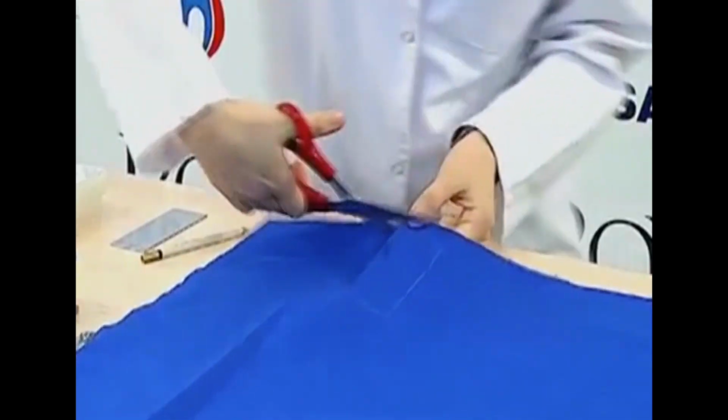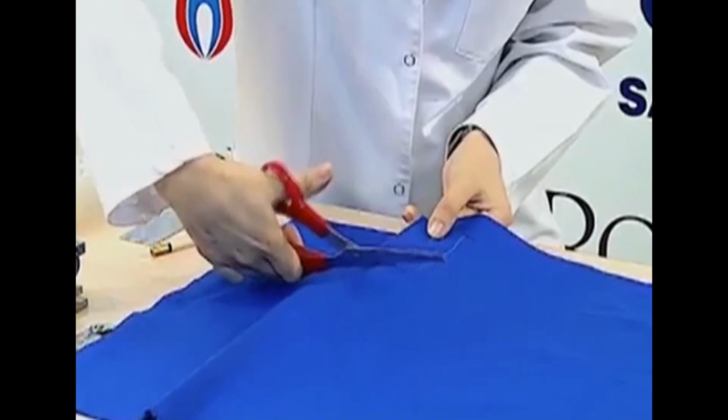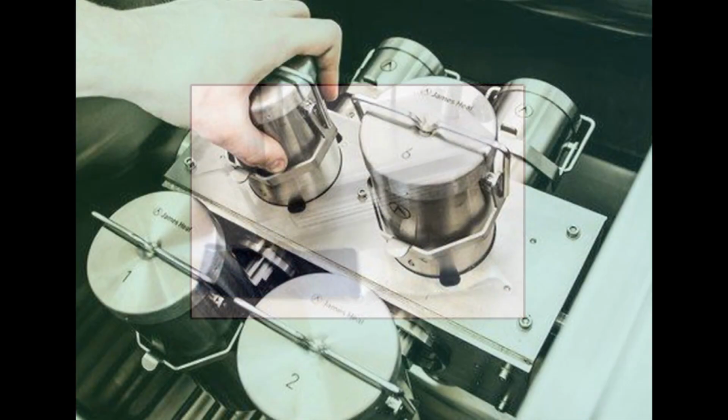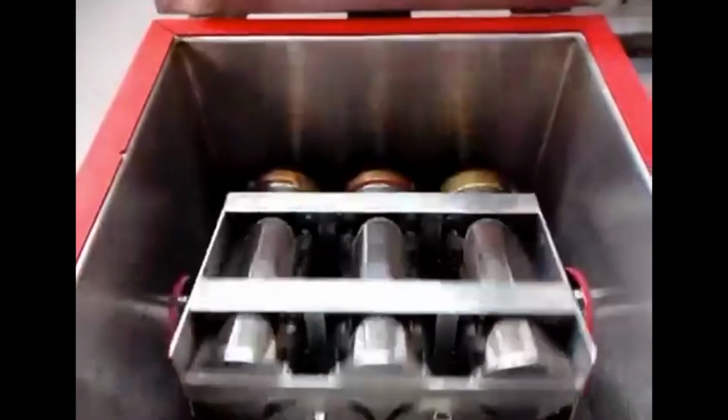So the procedure is like this. A test specimen, that is a colored sample of 10 by 4 centimeters, is prepared, and it is sandwiched from both sides using an undyed or white material. Generally a cotton material on one side and a silk fabric on the other side are stitched on either side of the colored material, and the test specimen is then placed into the laundrometer, and then the washing procedure takes place.